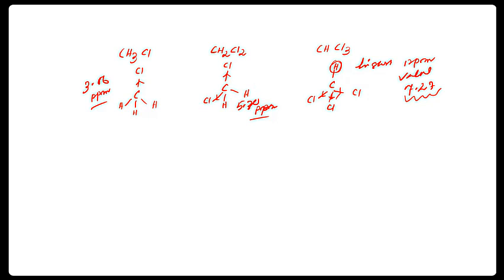Then this one, because this proton is electron deficient because of these two chlorine atoms, and this proton has a better electronic environment, as these three protons are attached to one chlorine via carbon, two protons attached to two chlorine via carbon. Basically, I don't say attached to chlorine, but attached to chlorine via carbon.